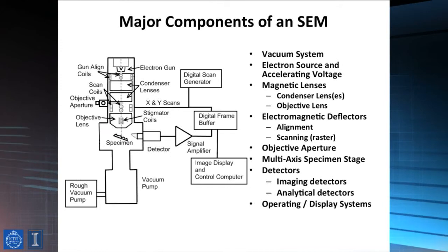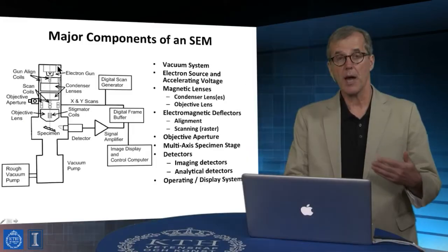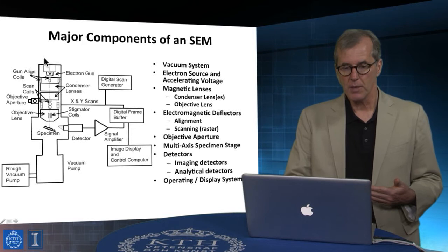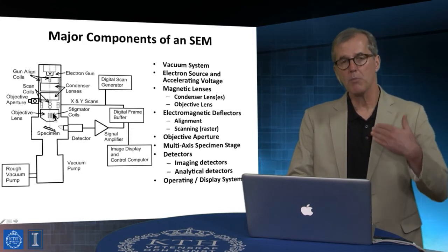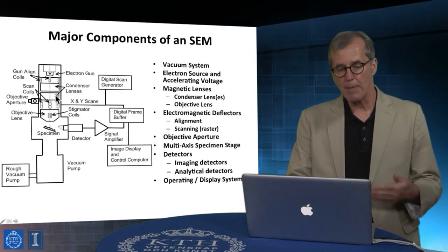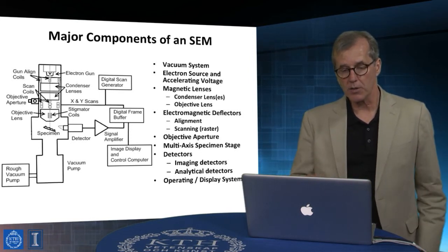Okay, this shows a more detailed description of that. Part of what I will point out is that, much as would be true with an optical microscope, electron microscopes always use compound lens elements, right? So for example, you have different kinds of magnifications that are possible. And we'll see more in the next set of lectures when we cover transmission electron microscopy. It's via compound lens elements that we get to very high analytical resolutions.